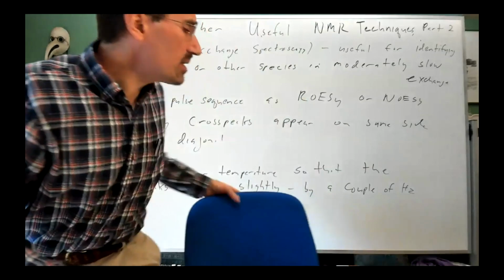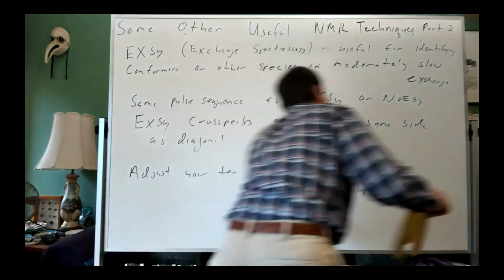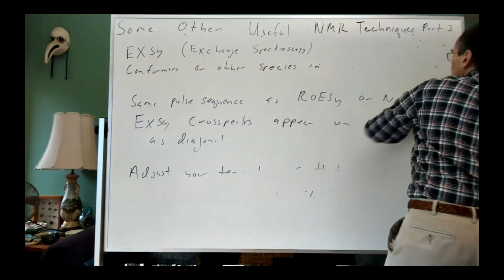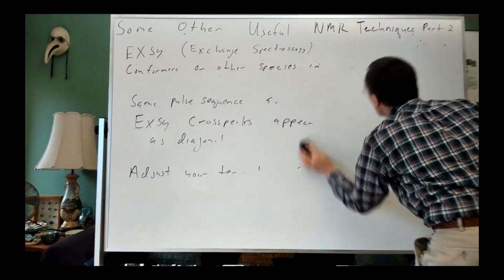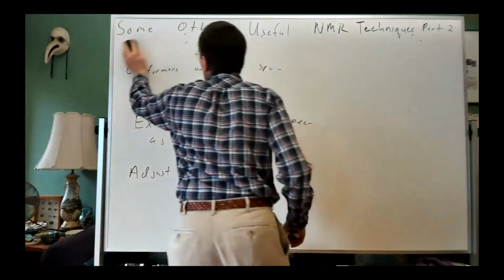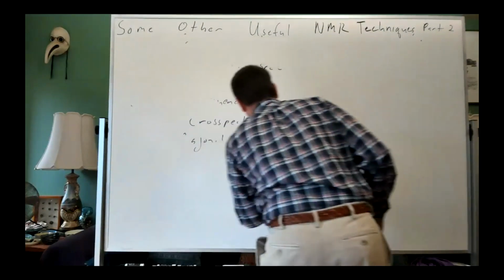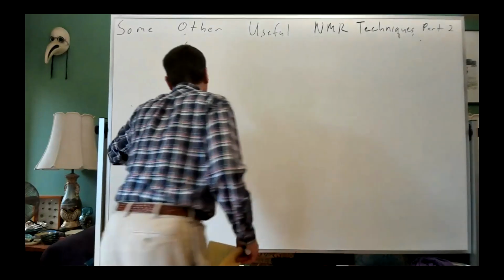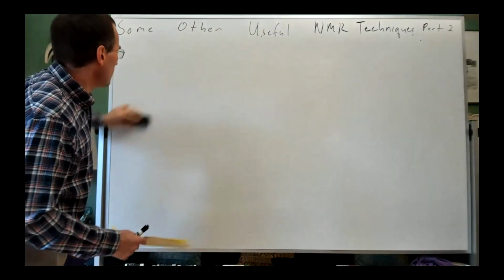All right, I want to talk about yet another technique that I found to be useful. And that technique is called DOSY, or diffusion ordered spectroscopy.